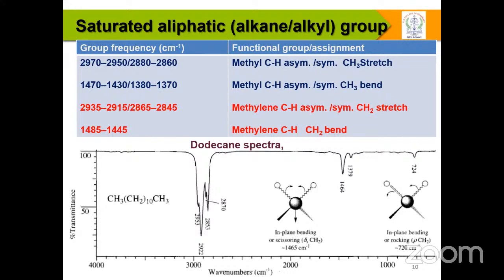So to understand simple alkanes, one should know where the CH stretch of CH3, the CH bend of CH3, and the CH stretch and bending of CH2 appear.